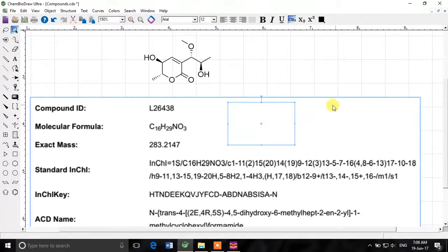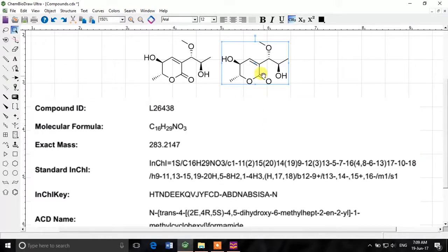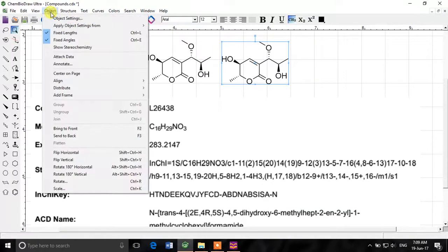Look, when I put it on top of this, it just disappears. I mean, it is going to the back of this image. What I want is to put it on the front of this image. So I can do two things. Either I right click, or we can use the object menu, but currently I'll try to explore it from the object menu.